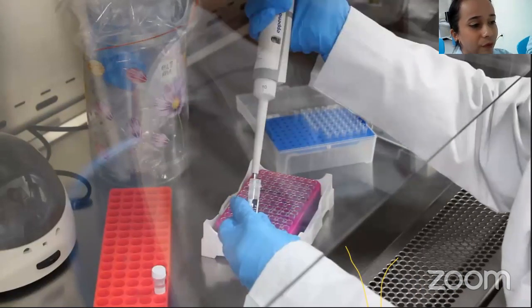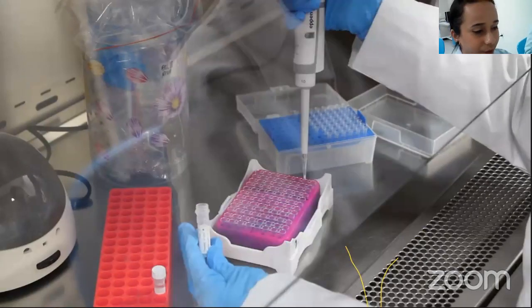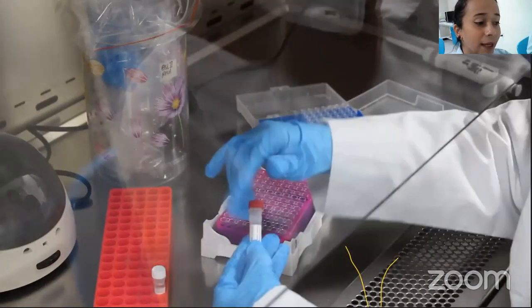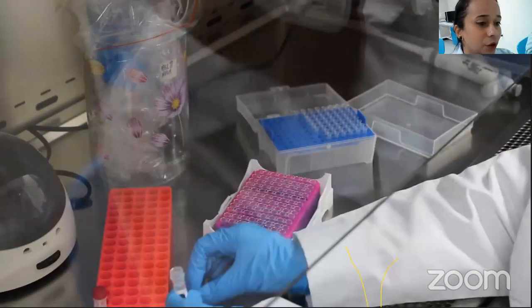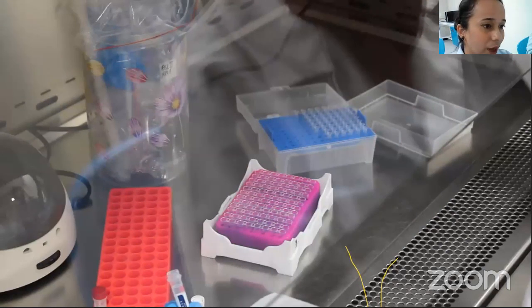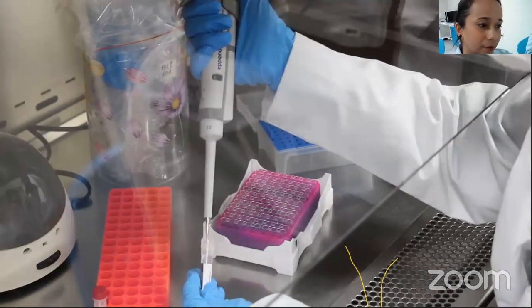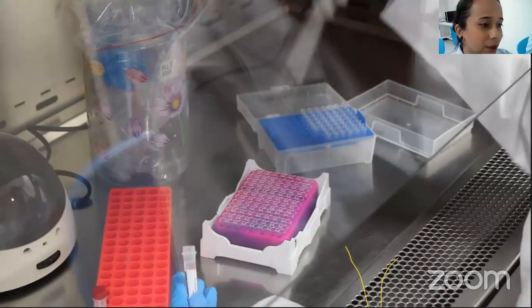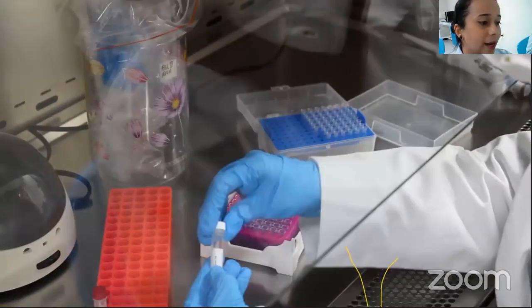You have to be very careful while you are adding this, because it can lead to massive contamination and result in false positives. Be very careful and immediately cap all your tubes and place them away from your plate. You have to be really careful. So this is the negative control. Cap it, place it away in the rack.